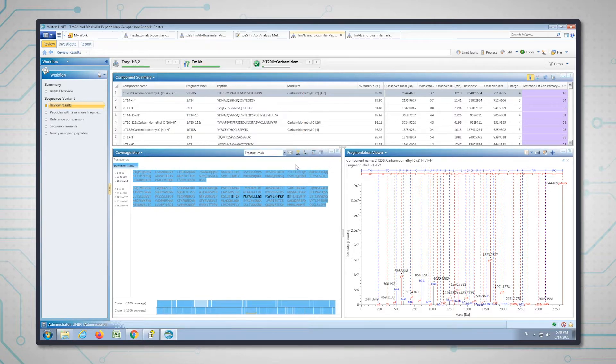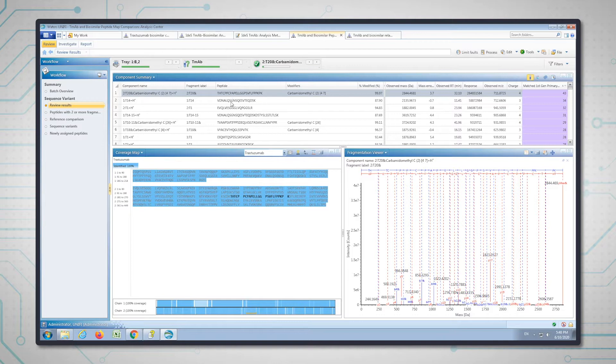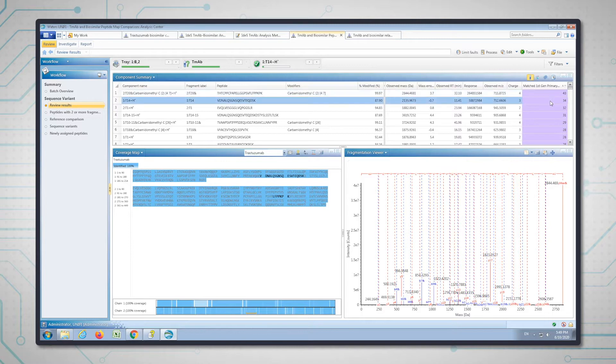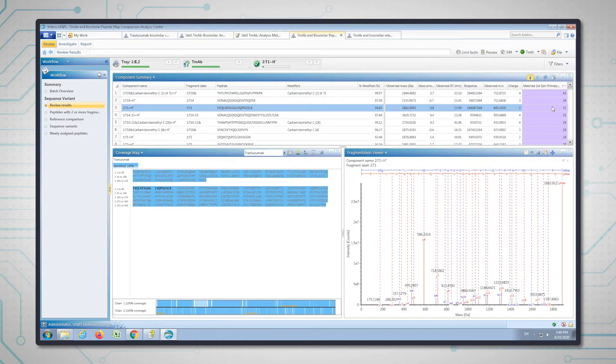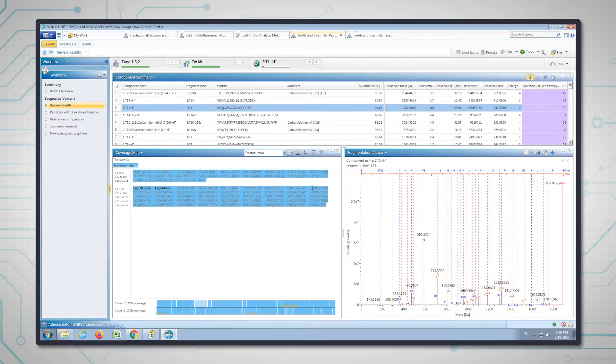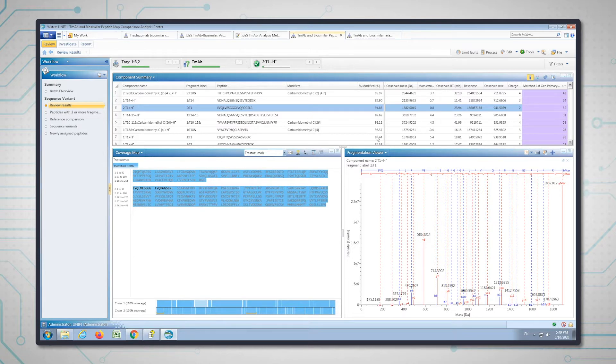In the first workflow step, we're reviewing the results. You can see this component table is ordered by fragment ions, so the peptides that have the most B and Y ions associated with them are ranked highest. We also have the coverage map and a list of the peptides that have been identified, with a modifier column and percentage modification.